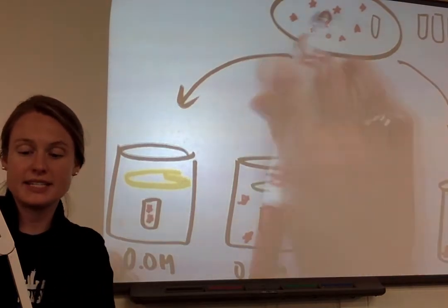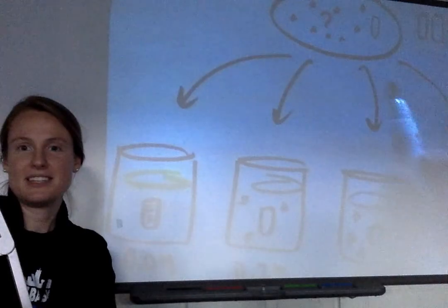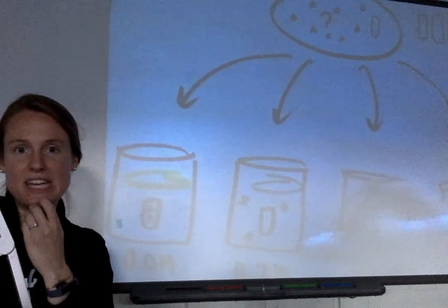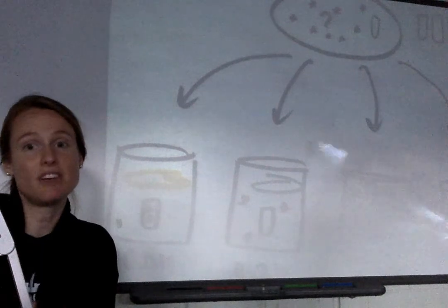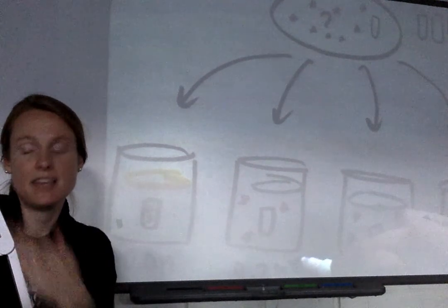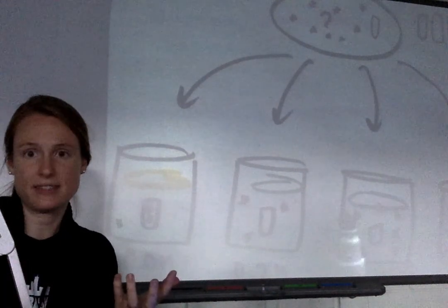So we put it into the yellow, and we know that it gained mass. I think I'm just going to keep going. So we put it into the green, and it, for some of you, gained a little mass. For some of you, it stayed 0. So 0% mass gain or loss. And as we went further on, all the potatoes lost mass.